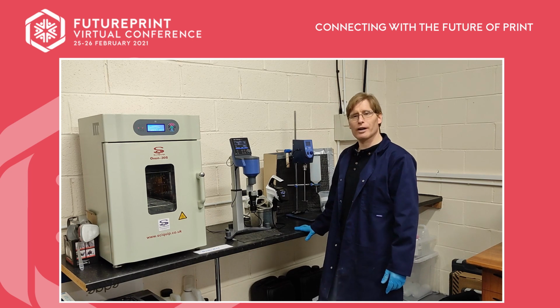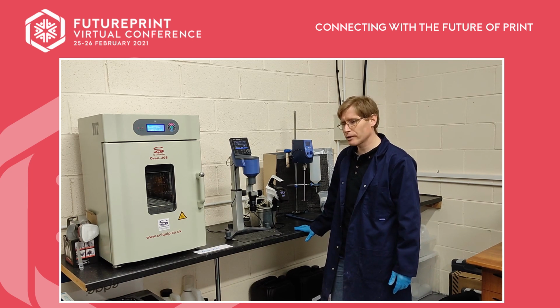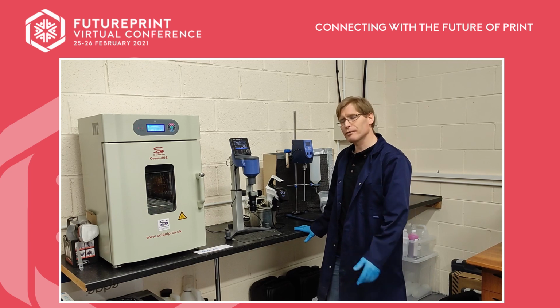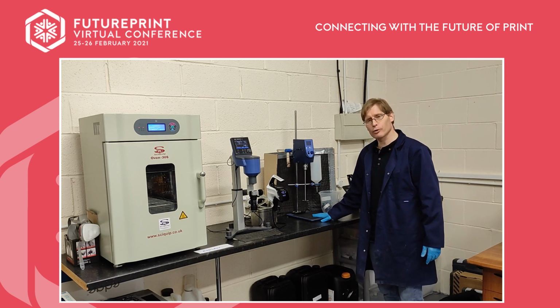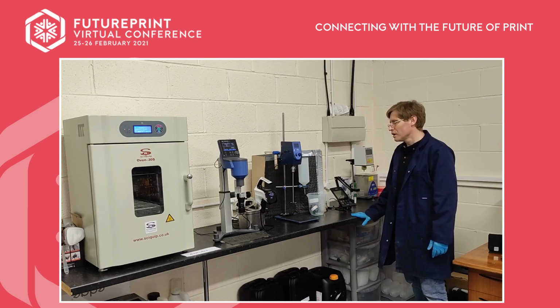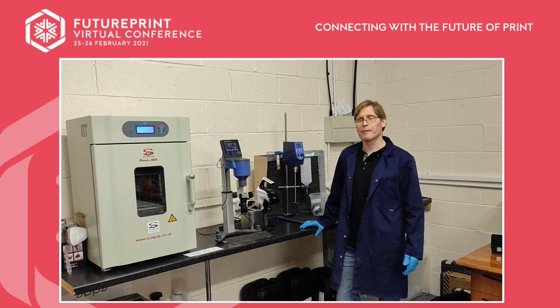If we need to modify viscosity of fluids, then we have some chemistry available to us that we keep in the laboratory. Diluents, for example, for UVs, or different types of solvents. But we also make simple chemistries using the mixer, and we can, of course, make those to specific viscosity, depending on the experiment.